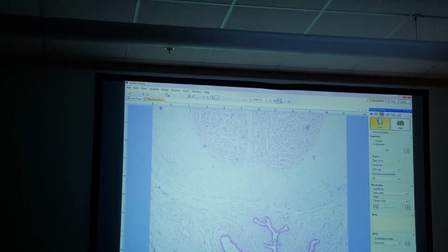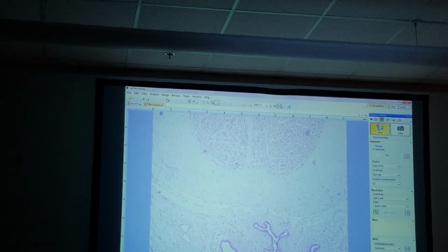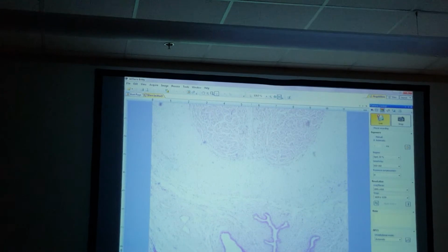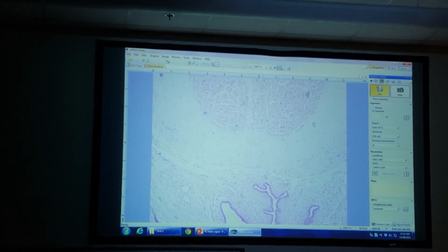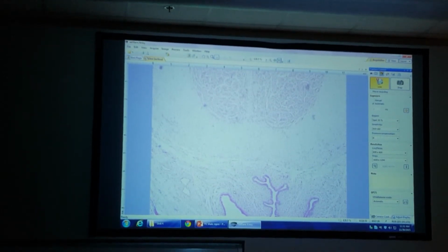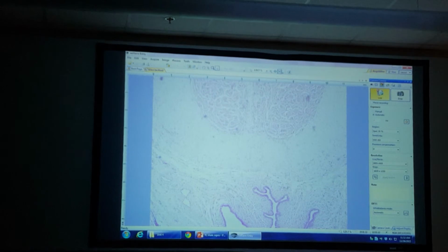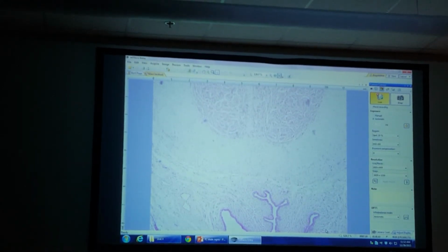The lumen is the spongy urethra. Say it again. The lumen is the spongy urethra. That's in here. The tissue around the spongy urethra, out here, that is all corpus spongiosum. All this tissue all the way around the urethra. It wouldn't matter where I point, here, or way over to here. Any of the tissue around the spongy urethra is part of the corpus spongiosum.